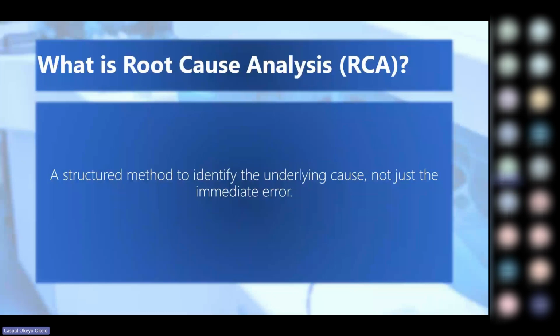A laboratory that masters root cause analysis becomes proactive instead of reactive. Instead of repeatedly fighting the same problem Monday morning, Tuesday morning, a structured root cause analysis will help us remove the structural weaknesses. Another important principle is that root cause analysis must be evidence-based.